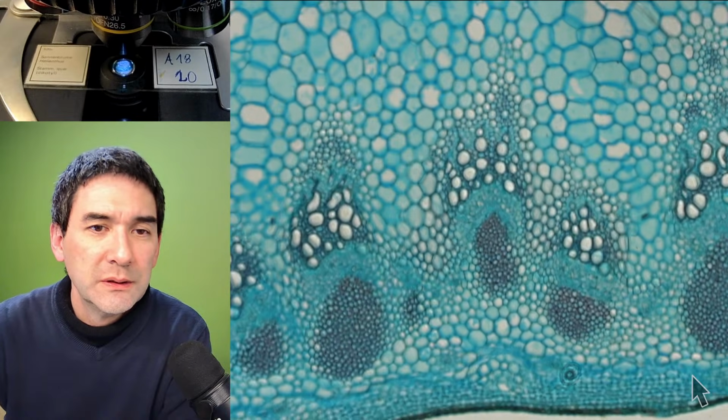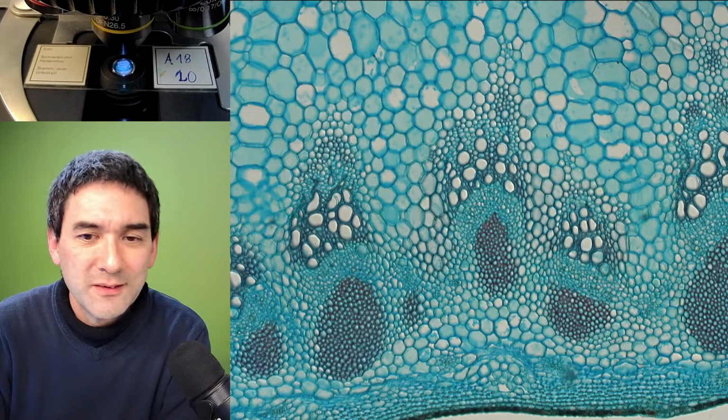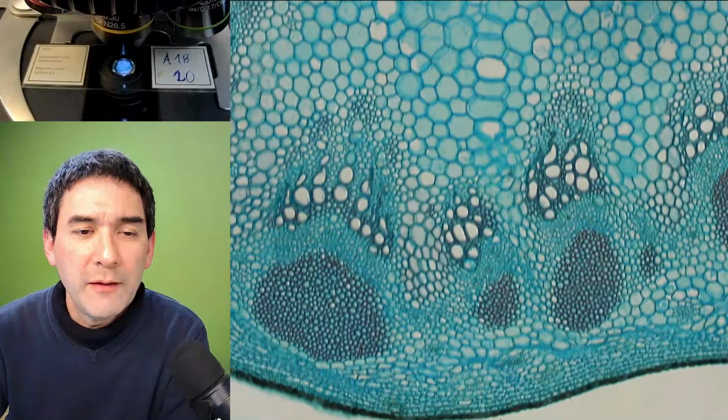Here we go. This is where it really starts to become artistic. So that's a sunflower. Yeah, that is really nice. It looks quite beautiful. And what we have over here is a sunflower, a so-called dicot plant.